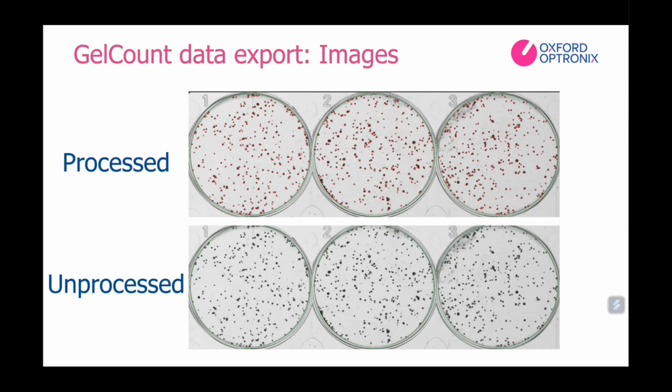Beyond that, it also demonstrates to others in your field or your lab even that you are appropriately counting your organoids and can act as a nice check and balance to anyone's research.